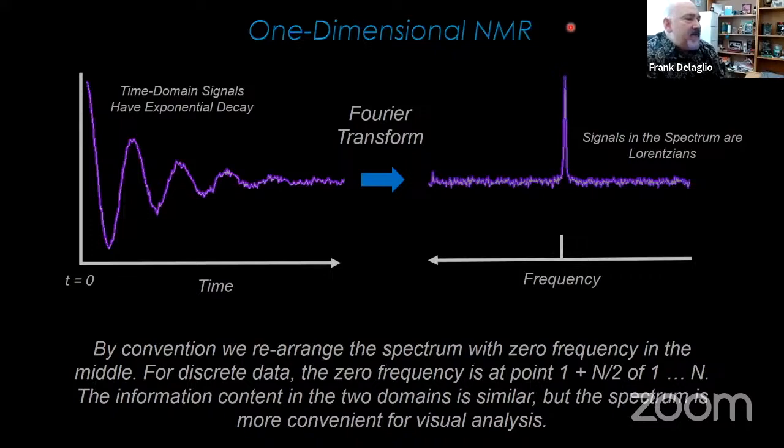What we'll do in this presentation is talk about some of the mathematical details of NMR signals to try to explain why we're interested specifically to try to model them in the time domain and what advantages we expect to gain by modeling spectral signals in the time domain. And then we're going to explain how the SAN method works, how we do this time domain modeling to get such excellent results, as we've heard from Professor Edison.